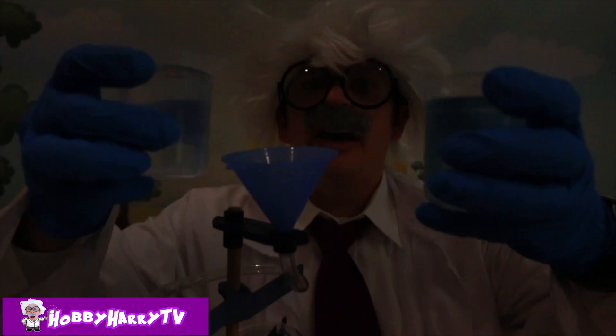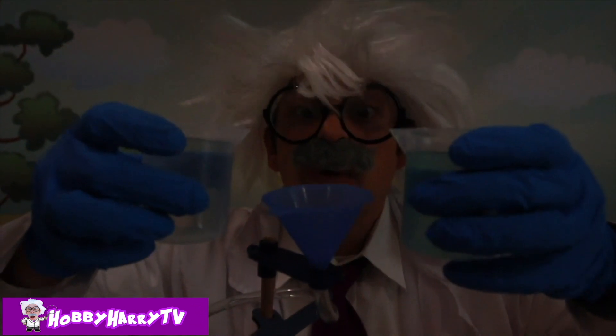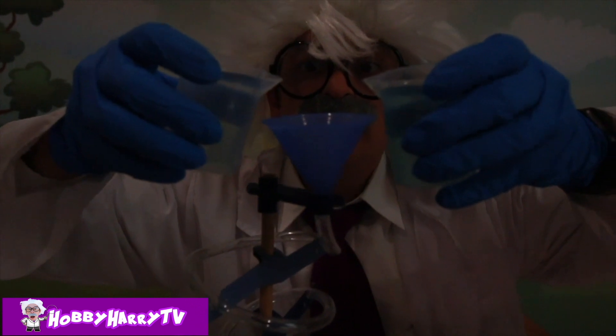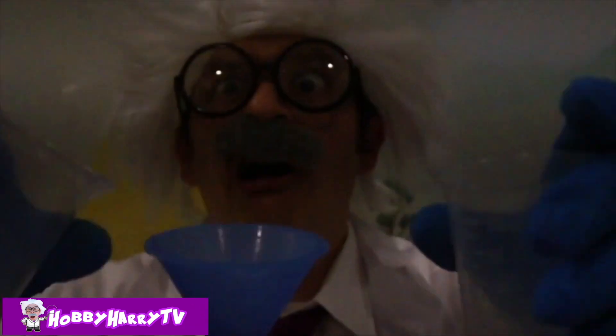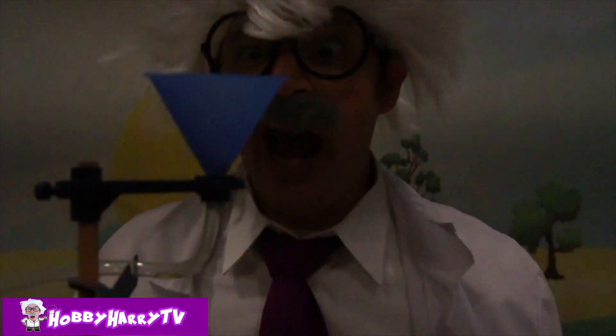Here we have our hydrogen peroxide and our luminol solution — we're gonna pour them in at the same time! Watch the glowing take place! One, two, three! I do not see anything happening! That was an epic fail! Oh man, I think it was too bright in here! Let's go to your super dark Batman dungeon and try this again!